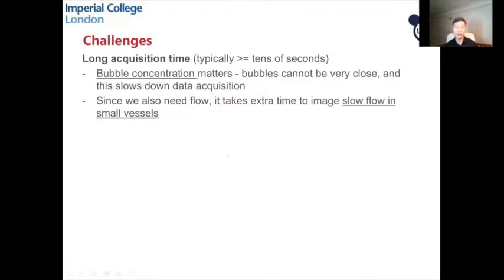I've shown you some examples. It looks wonderful, but lots of challenges still exist. One key challenge is the acquisition time. At the moment, it is quite long, typically tens of seconds, some a bit less, some even more if you're looking at 3D scanning.